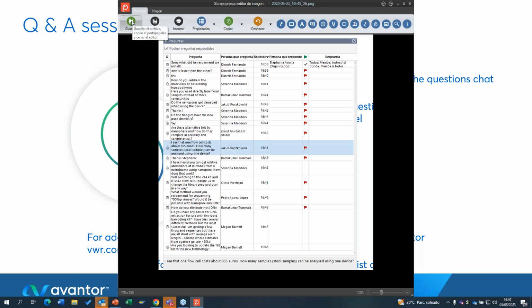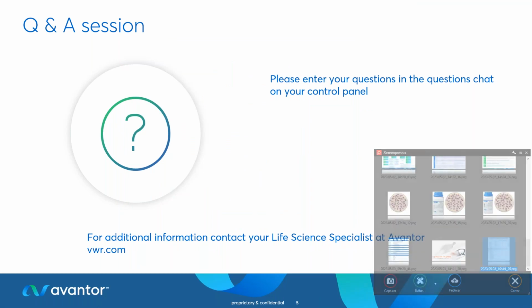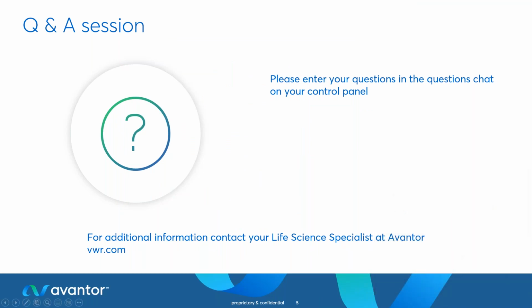If it detects any reads translocating through the pore that have the human reference sequence, it will reverse polarity and eject those strands from the pore and sequence everything else. So you can either do host elimination upstream using a certain extraction process, or you can do it the adaptive sampling way.